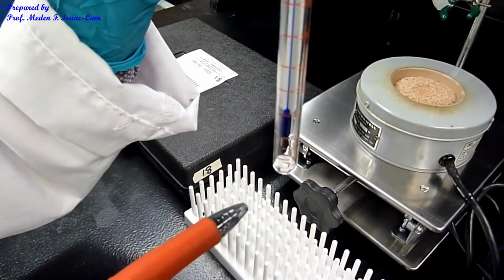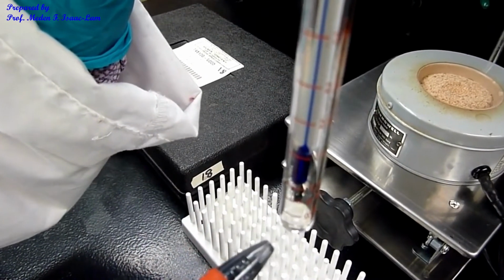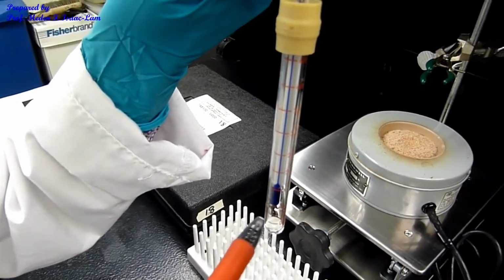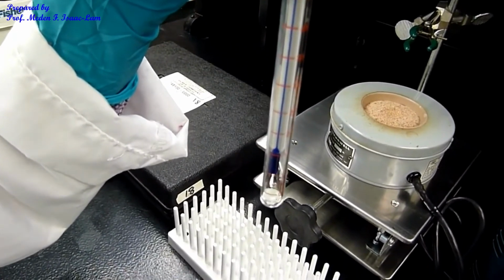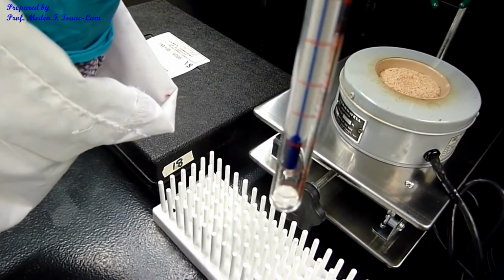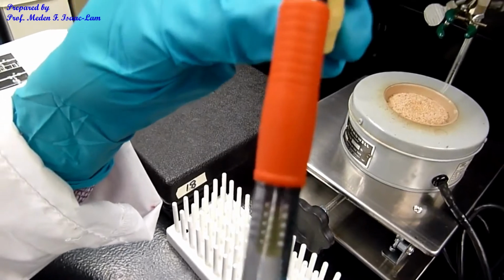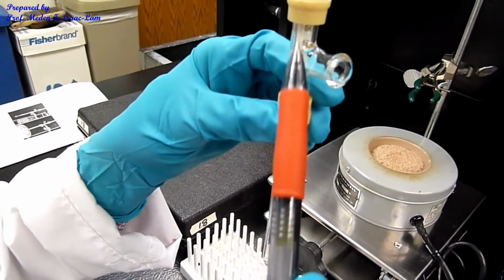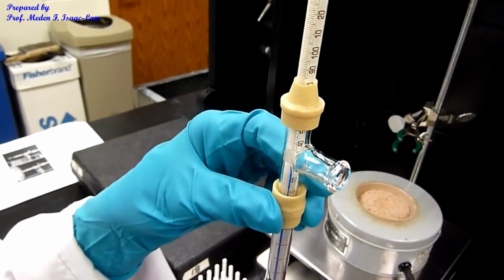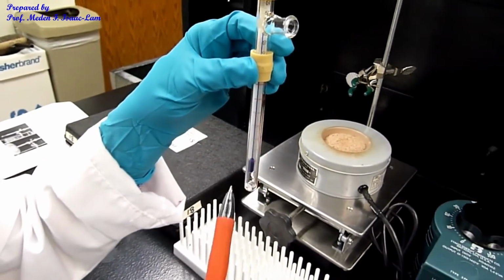So this is now the liquid in the reaction tube, and then I also have the boiling chip, and then I inserted the thermometer, and the bulb of the thermometer is sitting at about the 1.0 mL mark of the reaction tube. I don't have it entirely closed, so I have an outlet for the vapor, and then I attach the thermometer using the adapter, and it's not touching the sides. I don't want it to touch the side, and I want it to boil.